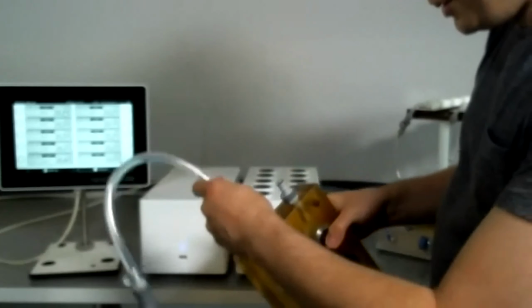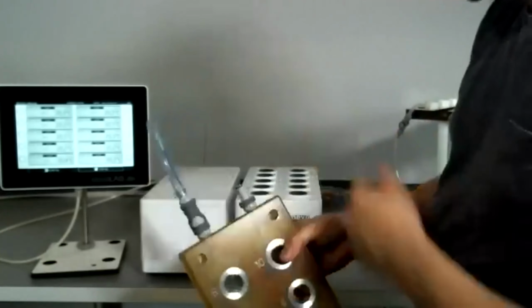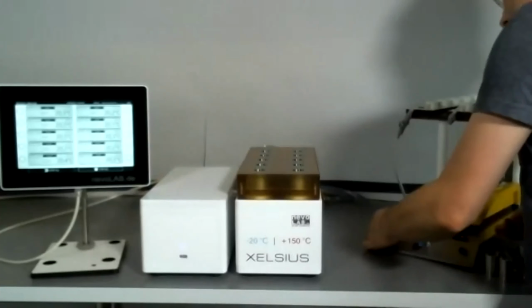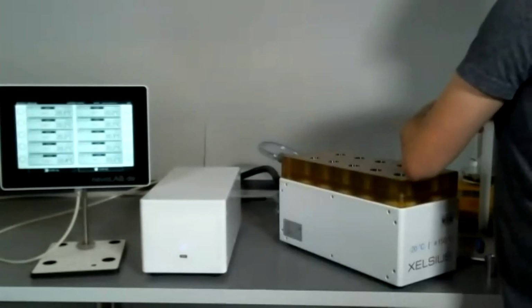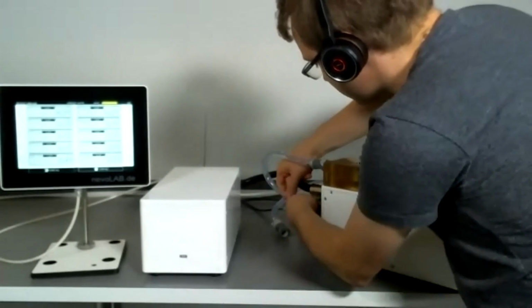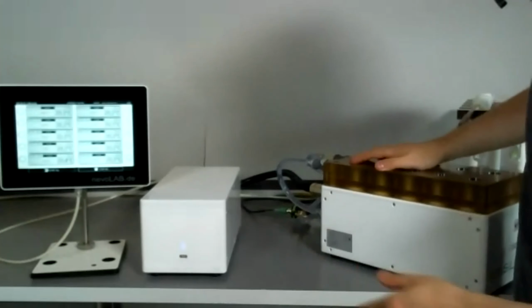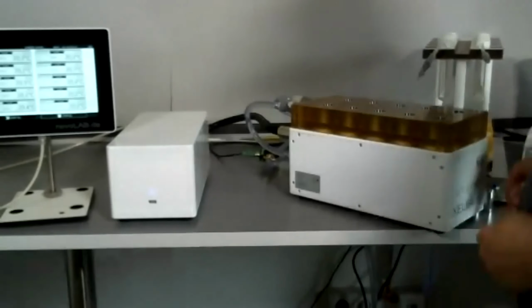So you do not need to be afraid to lose some water, for example. And you can just put it onto the reactor and connect it if you want to. You can connect it in line with our device with this little tube, and then just place the output of the external chiller, for example, one of those, to use one water circuit.